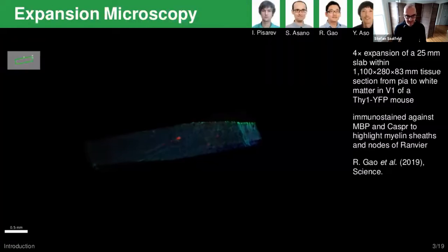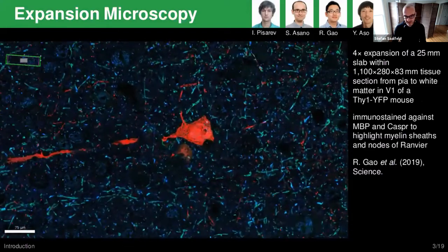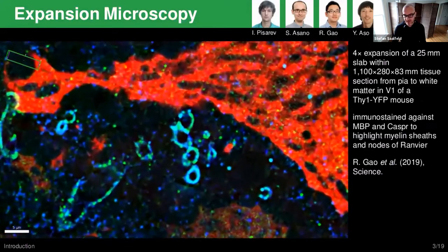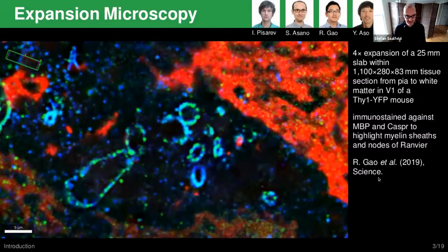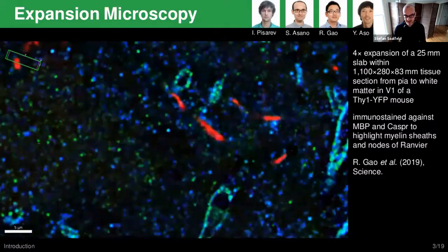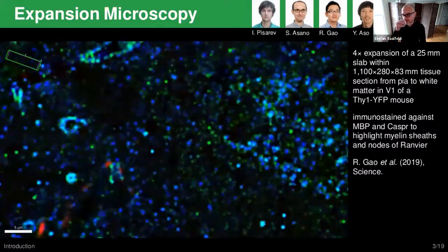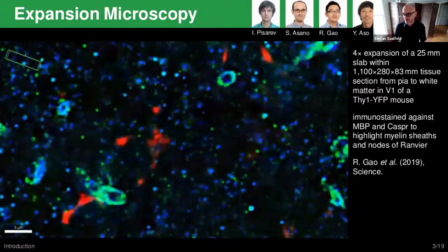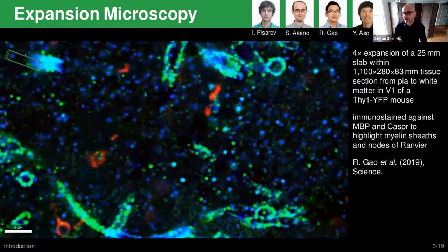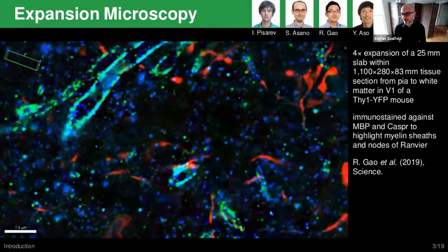The last example that I want to show you is this one. We developed the code to stitch tens of thousands of 3D tiles imaged with lattice light sheet microscopy by Eric Betzig and his people. This includes a method to estimate and correct the flat field of the imaging system from all tiles. The advantage in this case is that we have so many tiles, but unfortunately no flat field image, that we can reason the flat field from the 3D tiles.